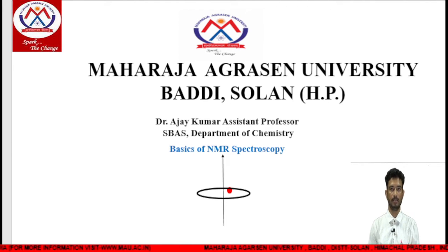So what are some basics in NMR spectroscopy that I will discuss in today's lecture.